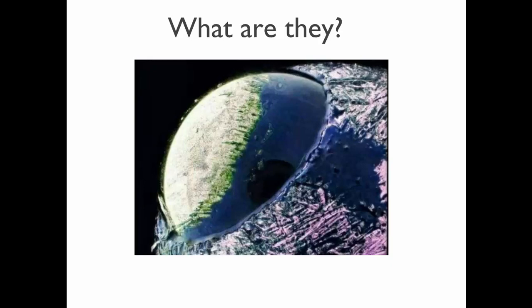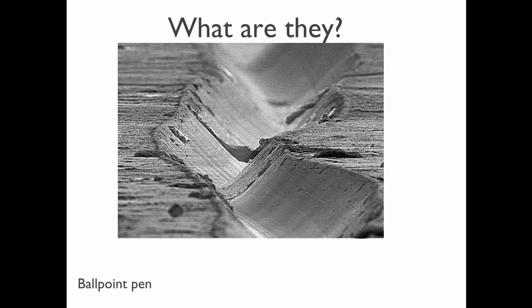This is the ball that rolls around, and that's how the ballpoint pen works. The great divide? That's the Grand Canyon. This is a record. The grooves on a record.